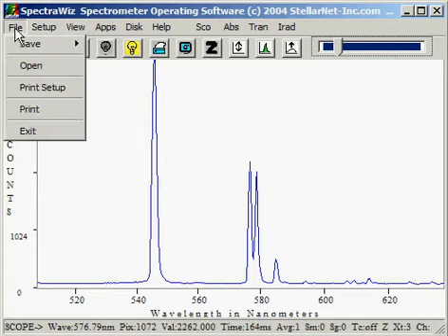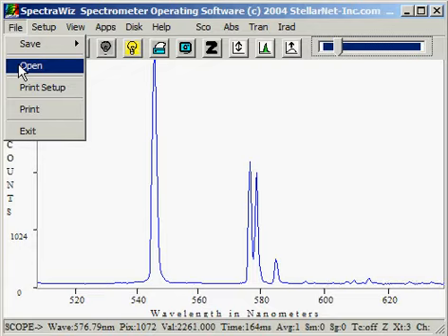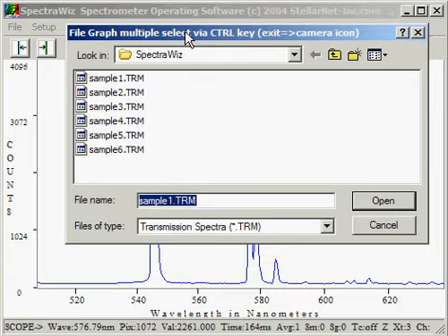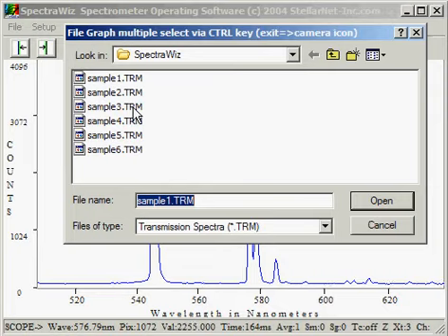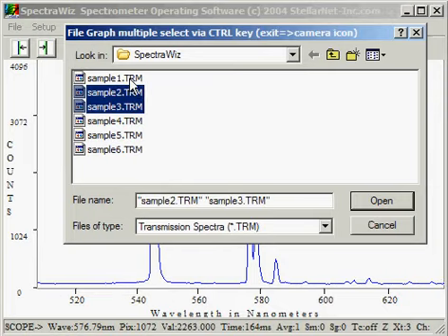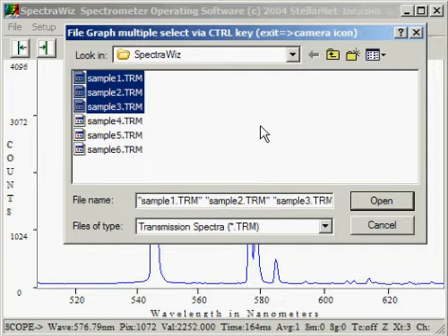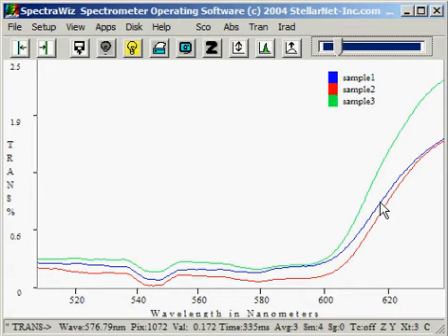The File menu also allows us to open files, which will then graph them on our display. We will select several samples by pressing the Ctrl key and highlighting the files. This is the Windows technique to open multiple files.